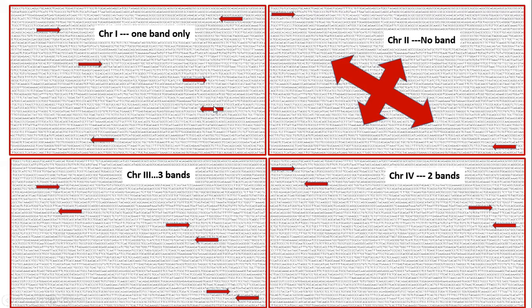As the primer is only 8 to 10 nucleotides, it will find a lot of complementary sequences given the repetitive nature of the genomic DNA. But that repetitive nature can also vary from chromosome to chromosome based on the polymorphism or variation between chromosomes. The primers bind randomly and they give different bands in the agarose gel pattern after PCR. So this is the RAPD technology, a fundamental mechanism.